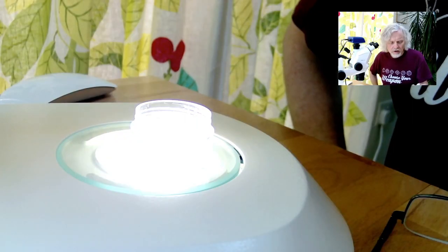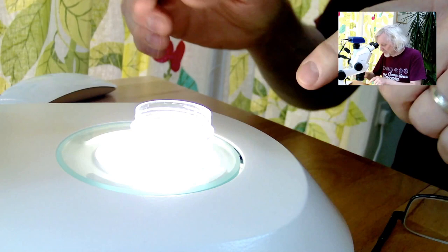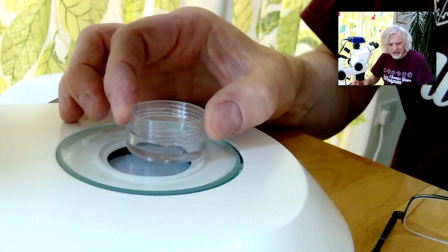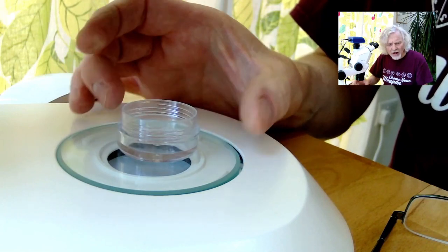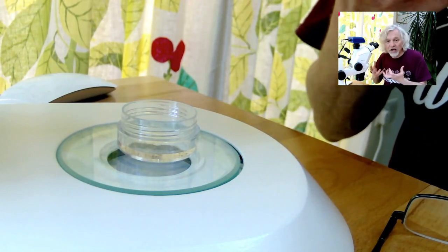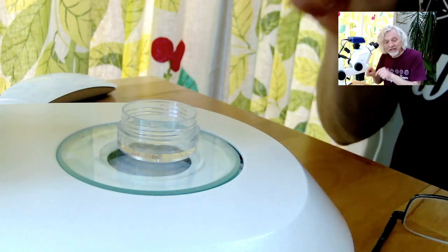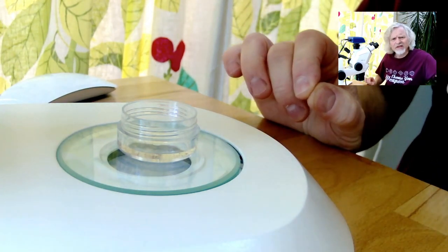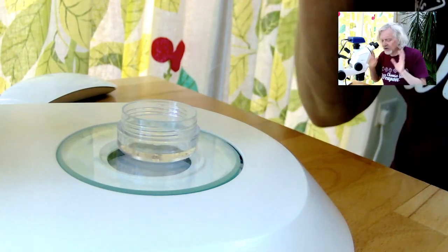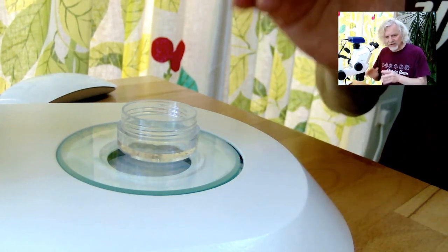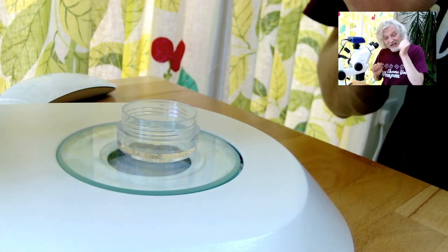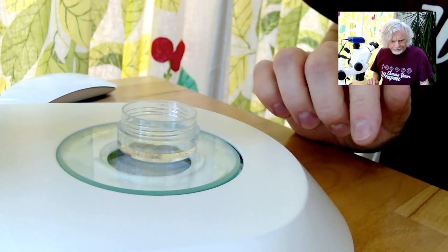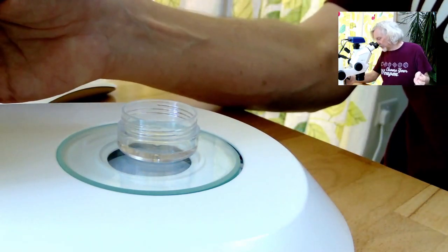Anyway, I'll show you what I've got under here. So here's what I've got. If I turn this light off, you can actually see it's just a little dishy dish. And what I've done is I've gone into my pond and I fished out a load of these things and I've transferred them into this tiny little dish because there weren't actually that many of them. I struggled to find enough of them to show you.